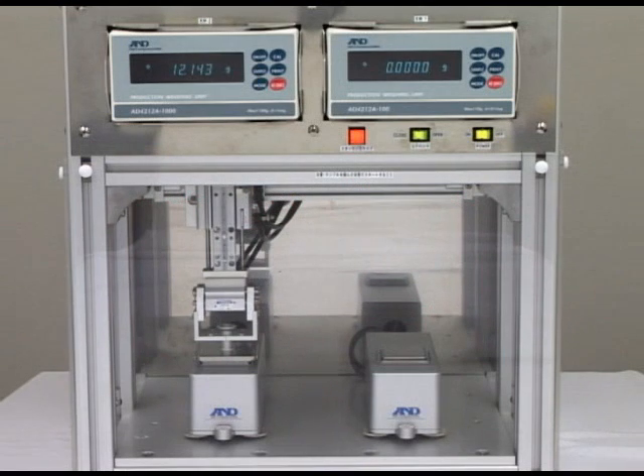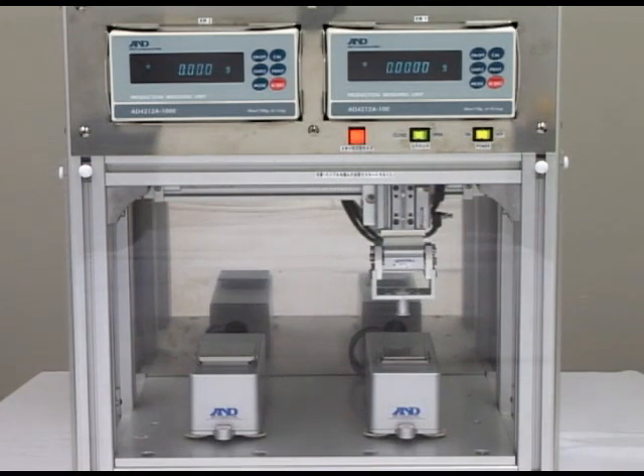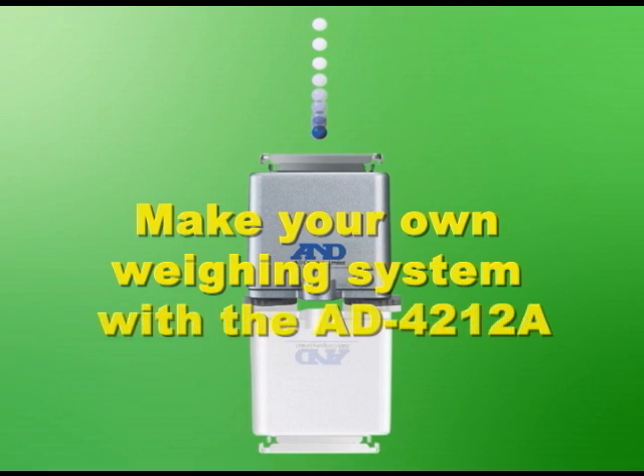The AD4212A provides a wide range of advantages, from a high speed response time to precise weighing measurement and compact design. This precision weighing sensor gives you the ability to make your weighing system even more productive.